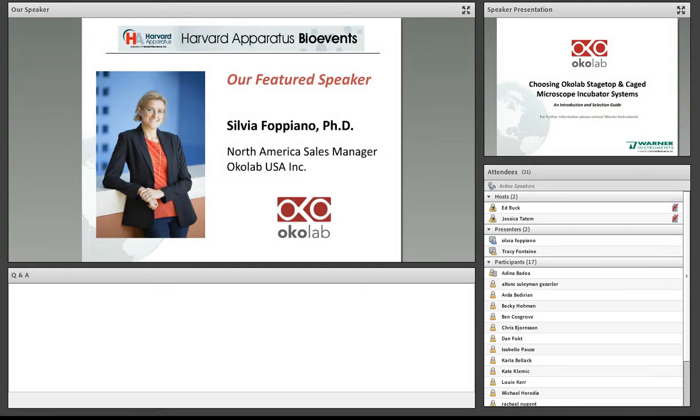Sure. How is the top of the stage top version closed to make sure that the heat and gases do not escape? Can you revisit that a little bit? Yes. So the lid has a circular opening and it's hinged in the middle. So imagine kind of like a wrench. You open a wrench, you put it around your objective and then you close it.